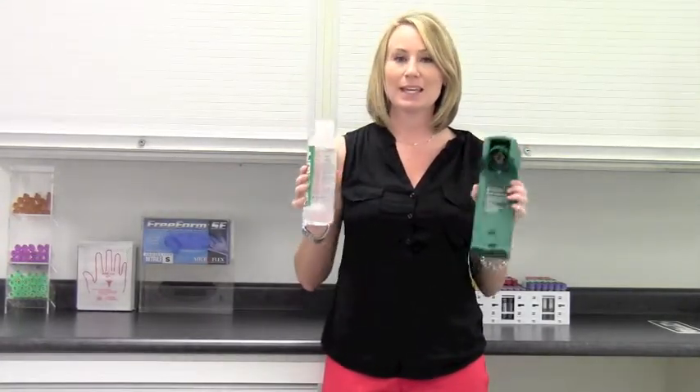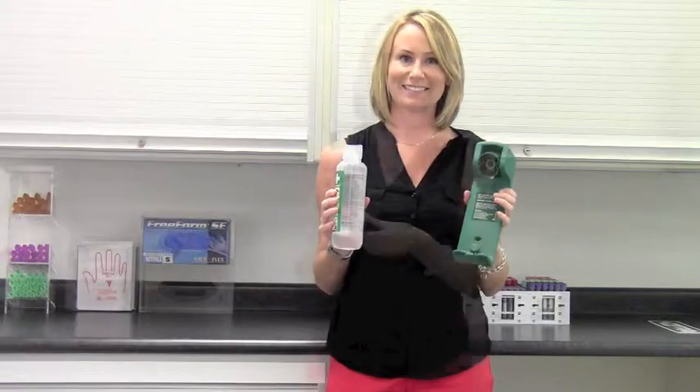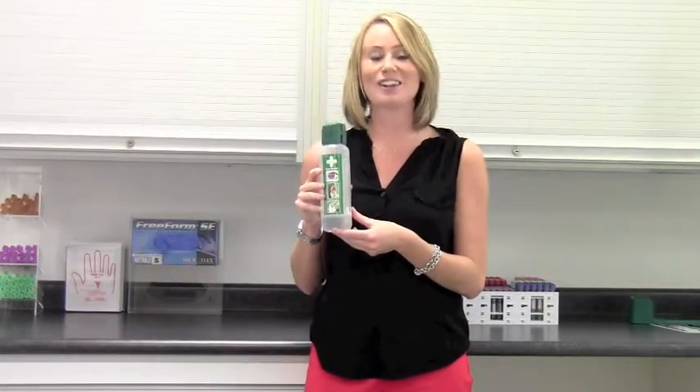Refills are available. Keep the Cedaroth Eyewash at every workstation to ensure the fastest response to eye contamination. That's the Cedaroth Eyewash, another unique solution from Pneumatic Medical.